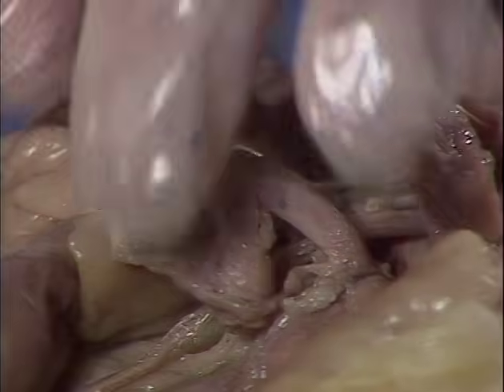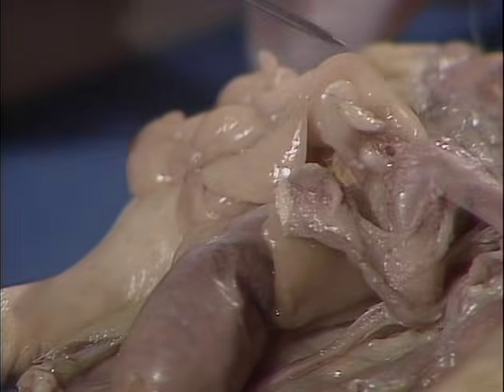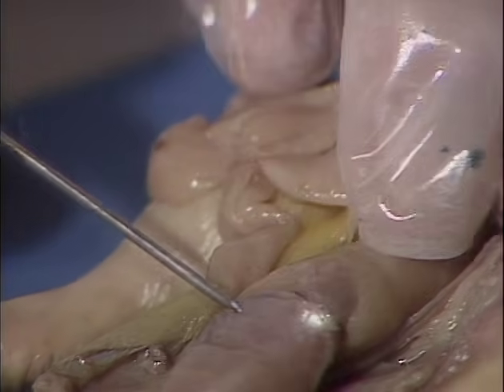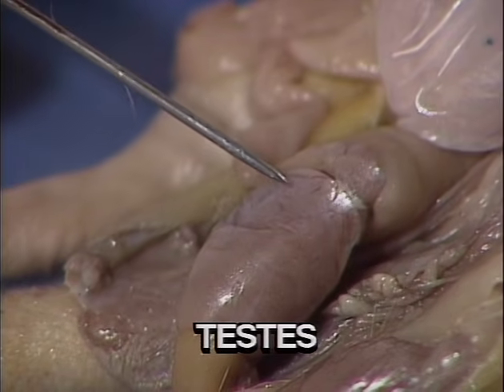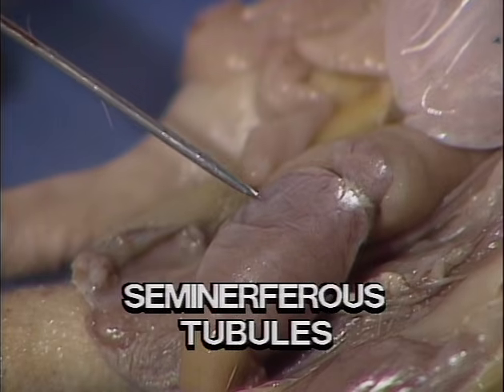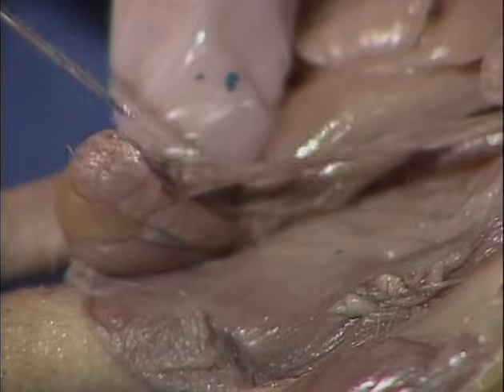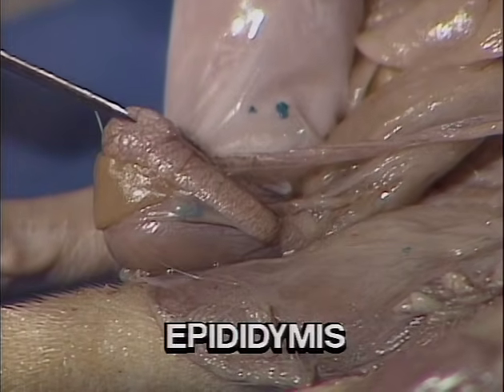This bag-like structure is the scrotum. I have cut it open so that we may view the testes and the epididymis located inside. This is the testes. If we look closely, we can see many small, tightly coiled tubes known as seminiferous tubules. They produce sperm. Once the sperm has been manufactured, they are temporarily stored in the epididymis.